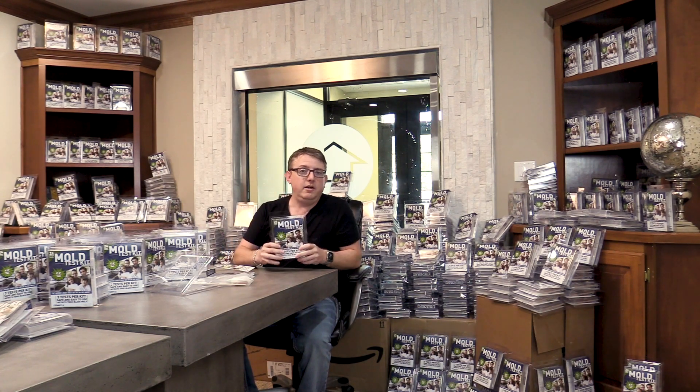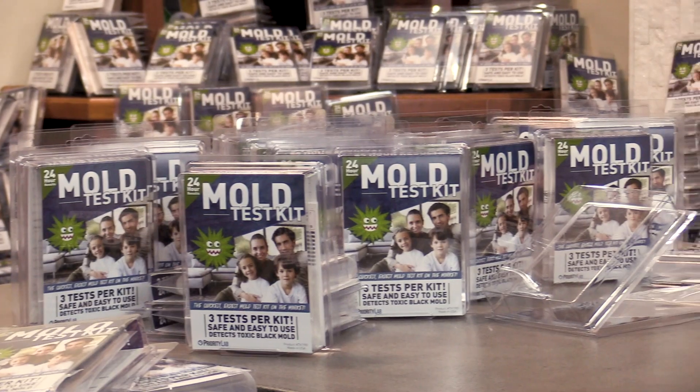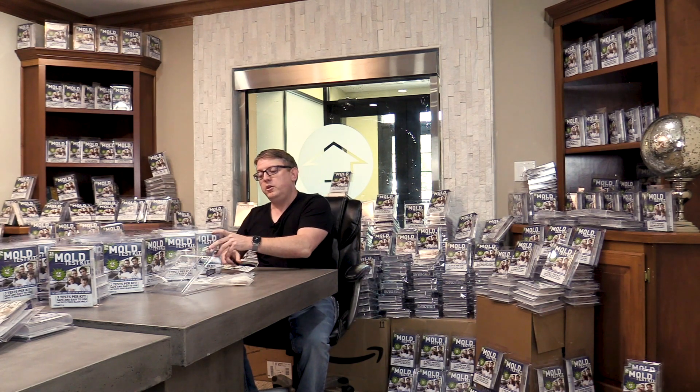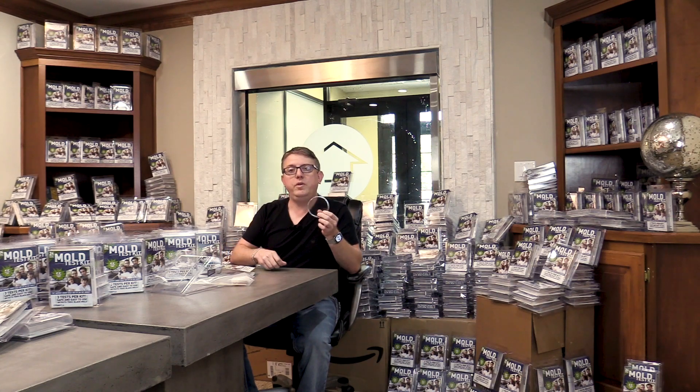One of the things that we looked into doing in the last few years and tested was what's known as a consumer mold test kit, and ours you can see right here. I'm surrounded by thousands of them at the moment. It's not unlike the style that you would find at your local Home Depot, Lowe's, or Menards. Inside of that kit you will find one of two things: either a simple plate with a liquid and a couple of swabs, or a unit that you can attach to your vacuum cleaner.